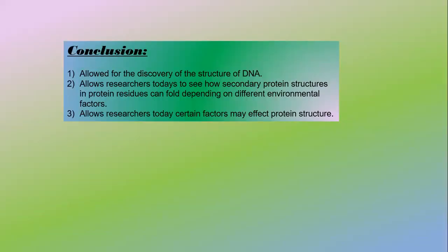Next, conclusion. It allowed for the discovery of the structure of DNA. It allows researchers today to see how secondary protein structures and protein residues can fold depending on different environmental factors. And last, it allows researchers today to see how certain factors may affect protein structure.